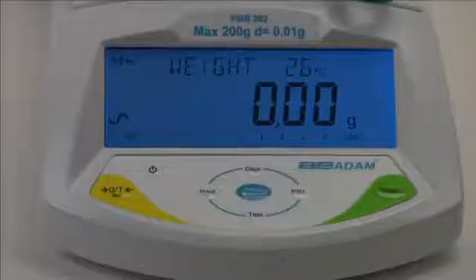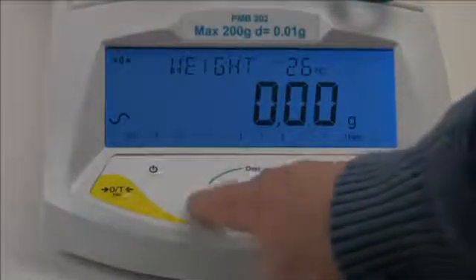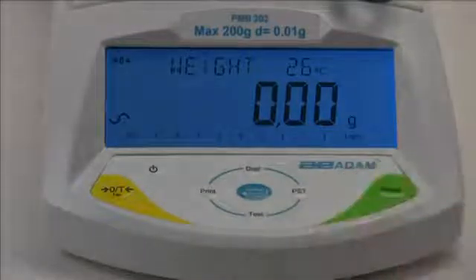Notice that the function keys are arranged in a cursor key configuration to provide up, down, left and right directional capability.